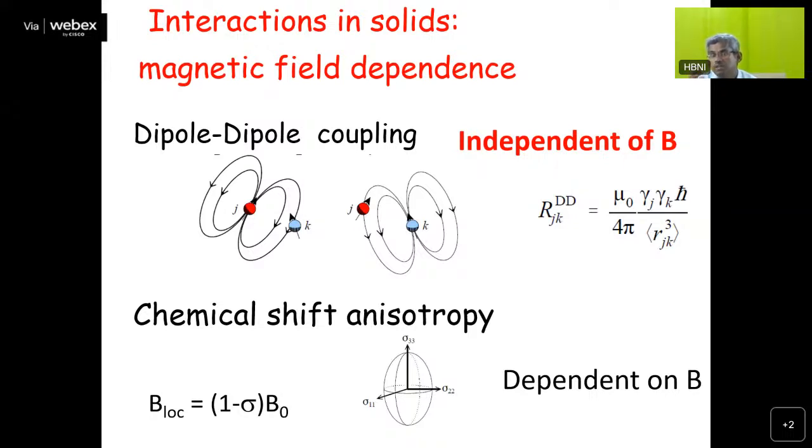That is why people say when you go for nuclei like platinum, palladium, lead-207, or tin, if you go to higher and higher magnetic field or higher and higher frequency, you will get more and more chemical shift anisotropy. So to get a reduced chemical shift anisotropy, you need to do the NMR experiment at lower frequency or lower magnetic field. The frequency is omega equal to gamma B0, where B0 is the applied magnetic field. Once the magnetic field decreases, obviously the frequency also decreases, because always people will write omega equals gamma B0.